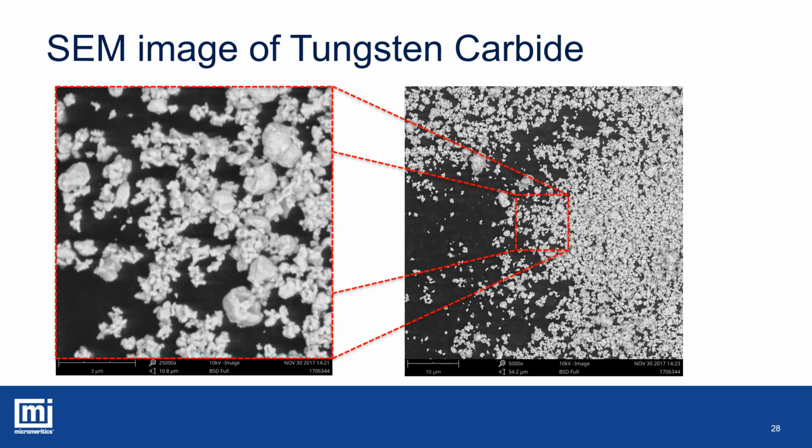They're very irregularly shaped. We can kind of make out some, so these two probably about 2.5 microns, and everything else looks to be smaller than that unless they're aggregated or fused together.